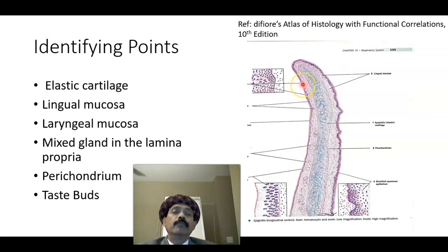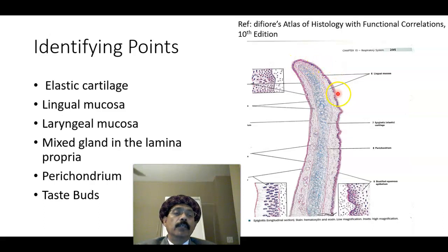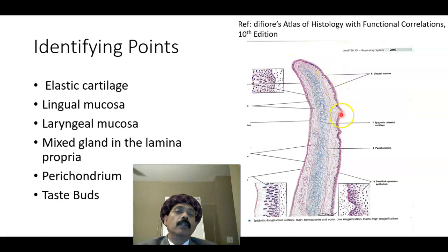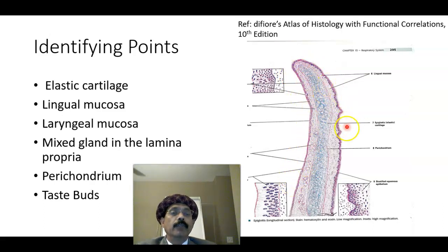You also get a few taste buds here, maybe on this side, maybe also on the lingual side. This is the laryngeal side. The laryngeal surface and the lingual surface.